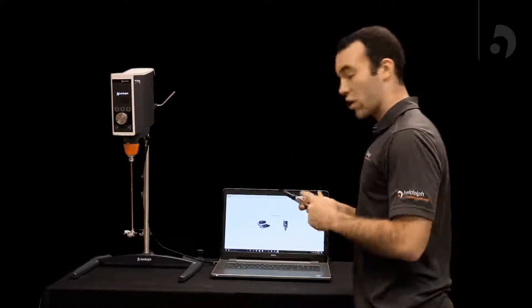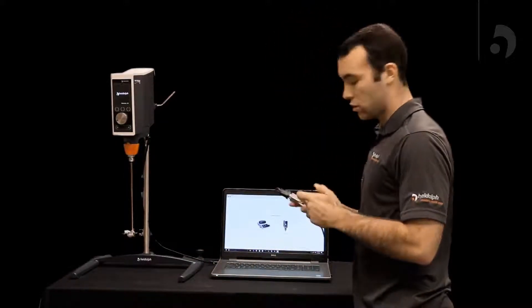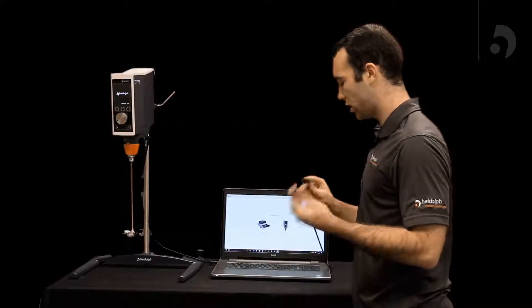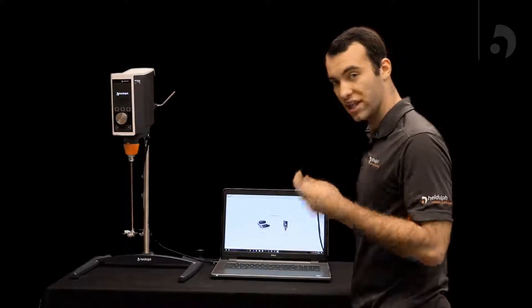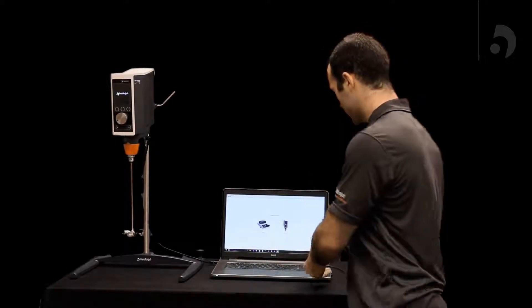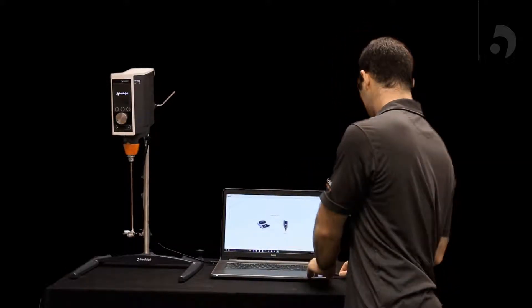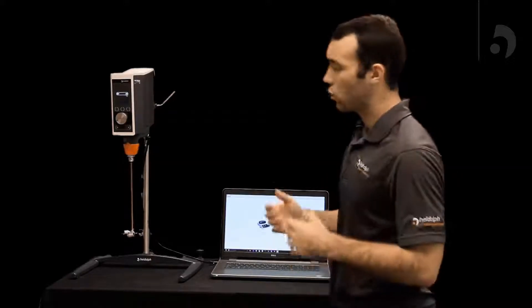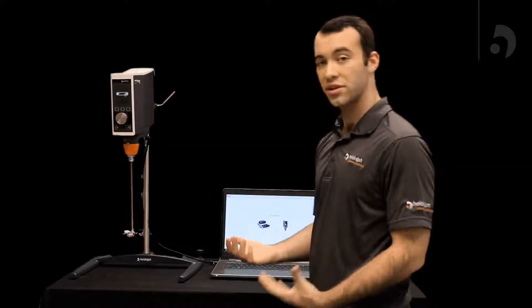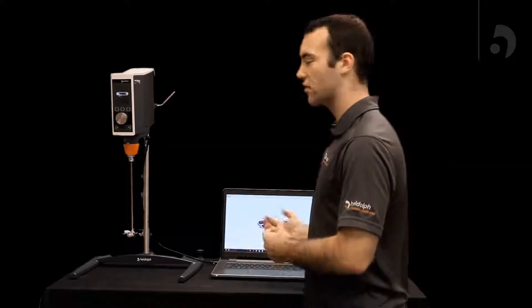You can either use an RS-232 or an adapter that changes to USB to plug it into your computer. Once that's all plugged in you can get onto the software.